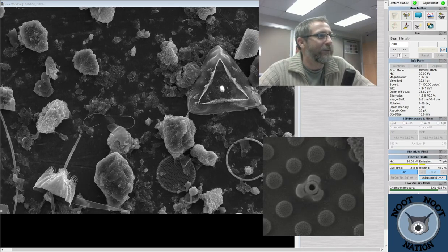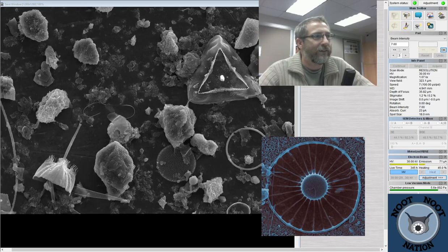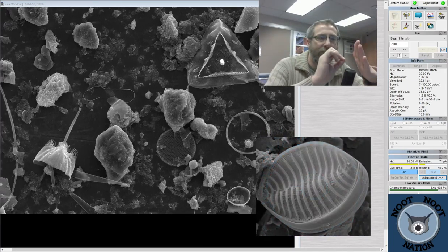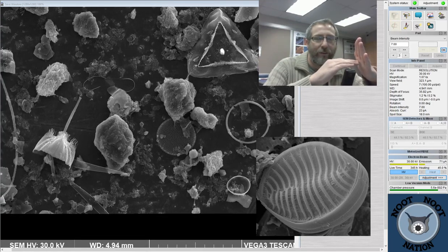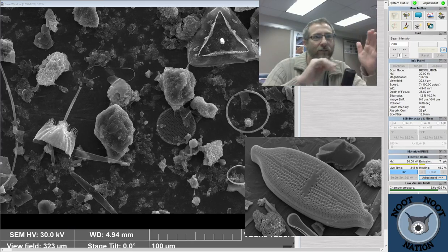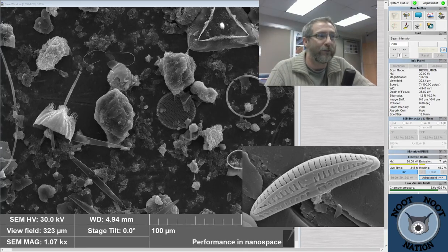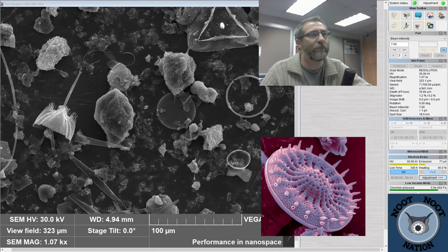Are there devices available that can render 3D images of diatoms? This was asked by Billy, Galaxy Art. The answer is yes. There's something called an atomic force microscope, which basically has a really thin little blade of metal that's held next to the material. As it gets closer, the energy from the material that it's analyzing causes it to vibrate, and it translates those vibrations into shapes. It will actually allow you to make a three-dimensional image of whatever it is. You could also put diatoms on a confocal microscope, but those are a lot cheaper than an atomic force microscope, and it uses a bunch of lasers in different directions to make a 3D image.